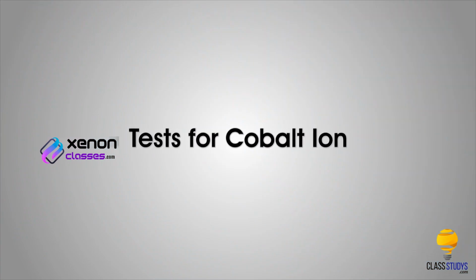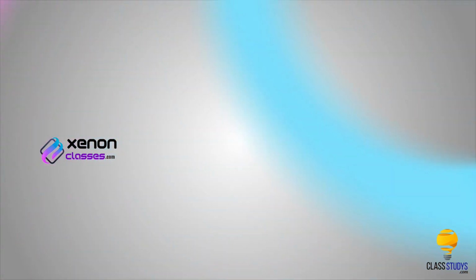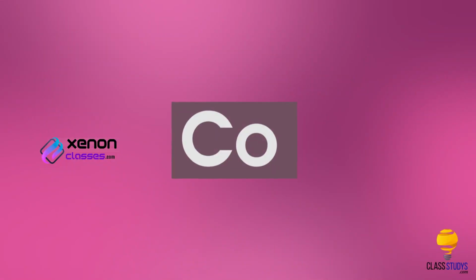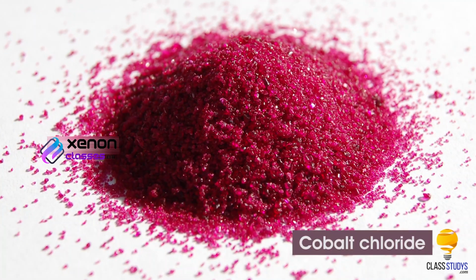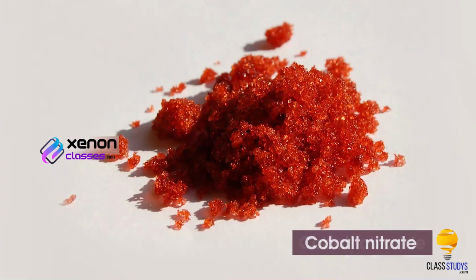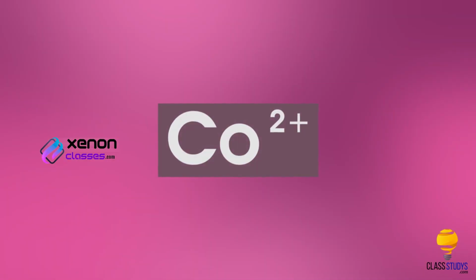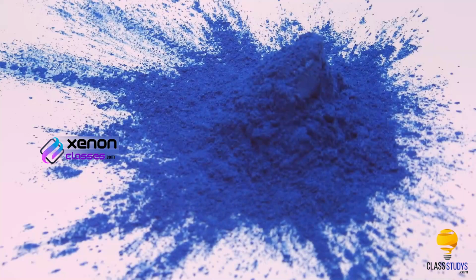Tests for cobalt ion. Cobalt is a chemical element with symbol Co. It is found in various salts like cobalt chloride, cobalt nitrate and cobalt carbonate as the cobalt-2 positive ion.